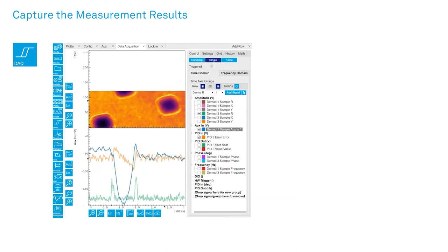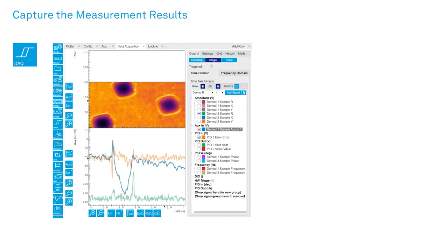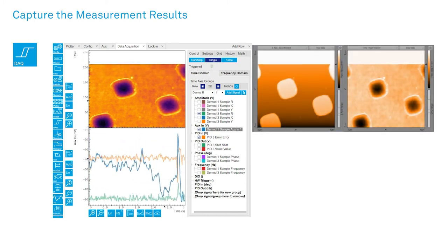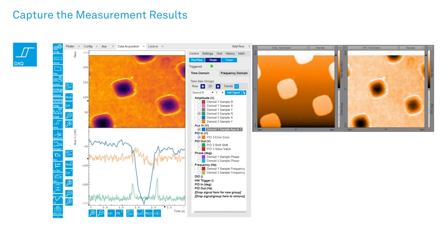Also, we can feed the measured contact potential difference back to the AFM controller with the Lock-in Amplifier's auxiliary outputs. Then we can compare both side-by-side in Nanosurf and LabOne software.